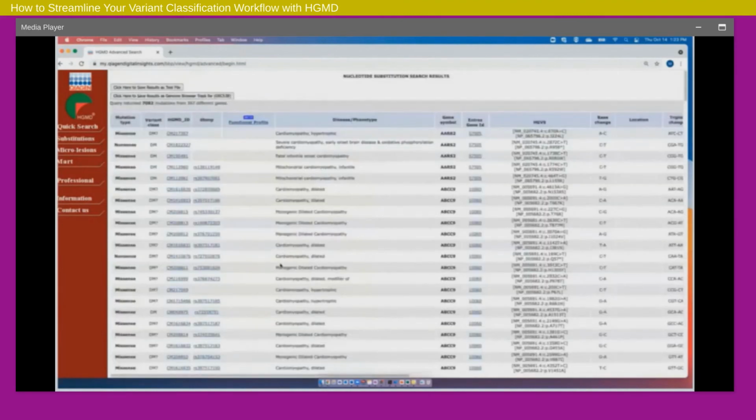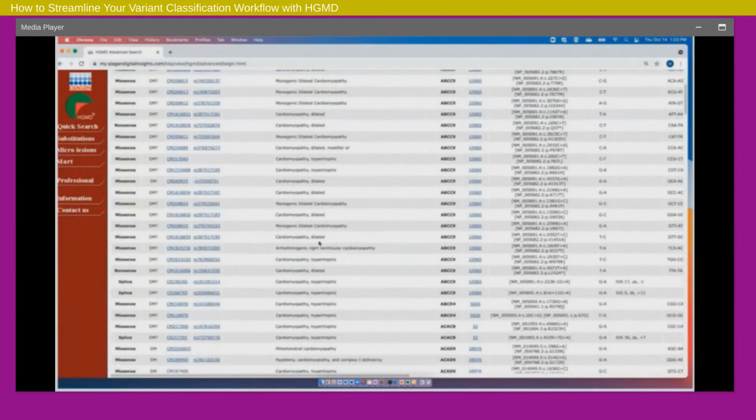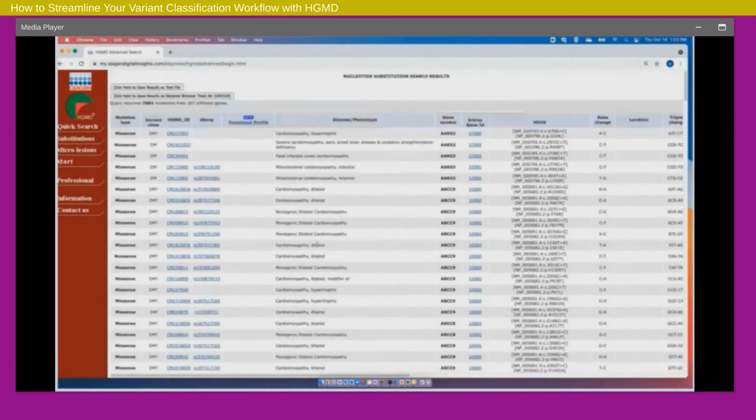And at this point, it pulls up that table, and I can actually download a bed file that you can then load into UCSC, and then you can visualize across all of the associated genes with cardiomyopathy, the known variants. So if you then wanted to go and design targets for a panel, you can make sure they're covering all of these associated HGMD entries.